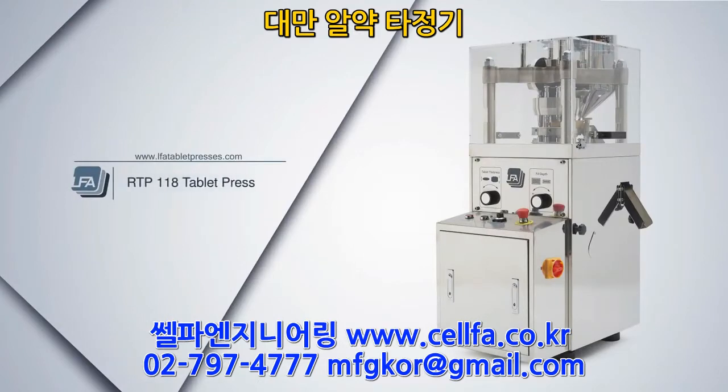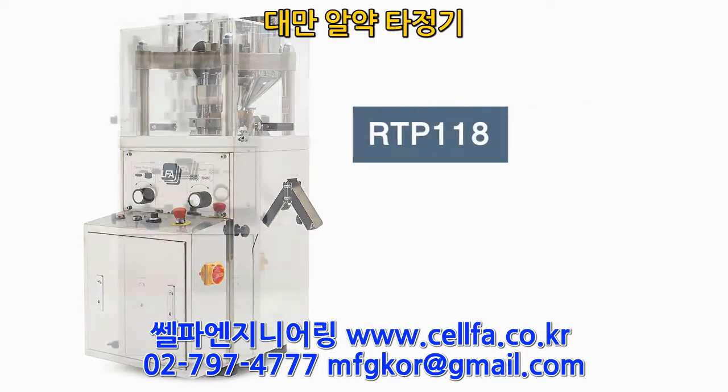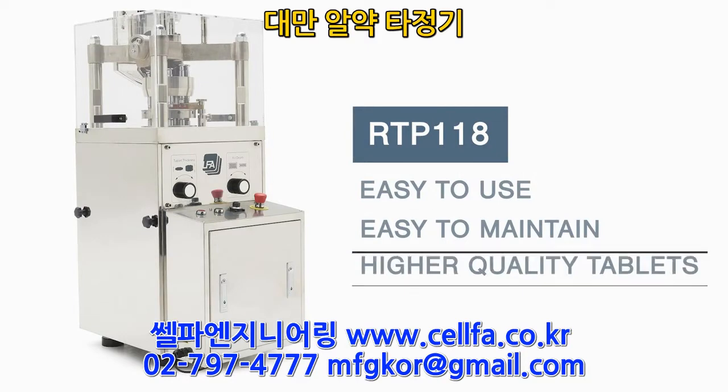Welcome to LFA's video on our RTP-118. The RTP-118 is an exceptional tablet press designed by LFA to be easy to use, easy to maintain, and to provide you with higher quality tablets.